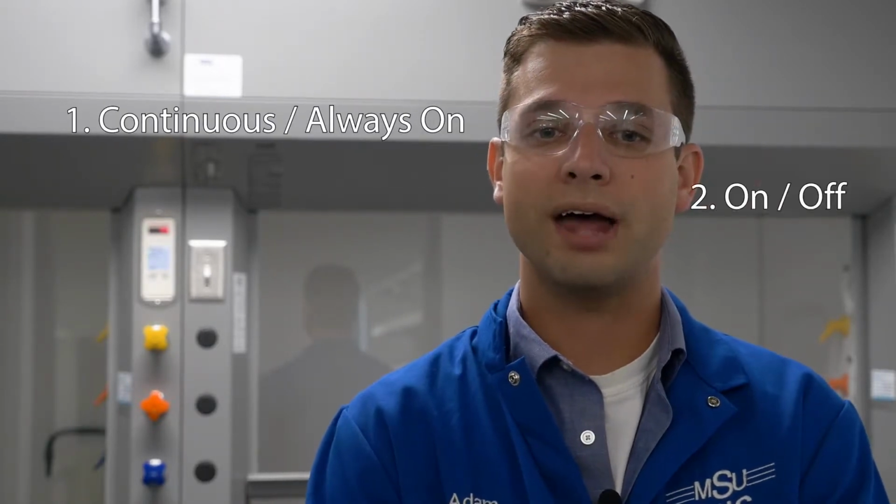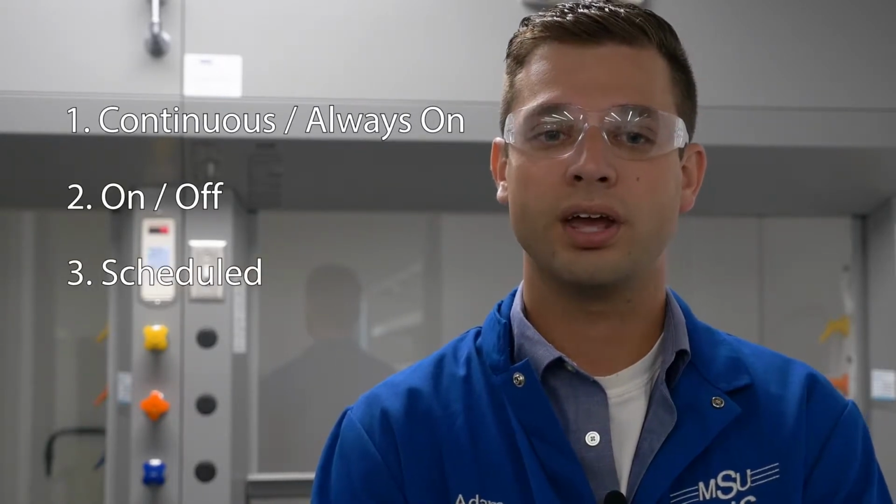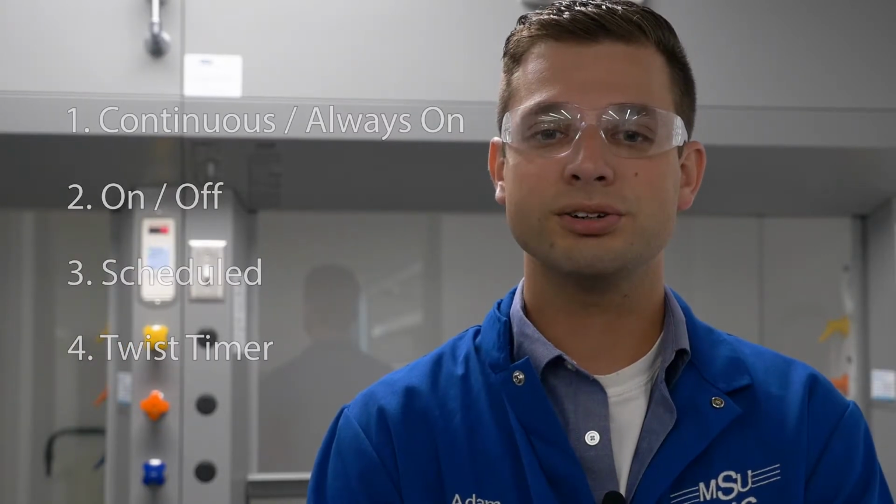Let's start with the power to the fume hood. Fume hoods at MSU have 4 different power modes. 1. Continuous or always on, 2. On or off, 3. Scheduled, and 4. A twist timer. Continuous fume hoods run all the time and never turn off.